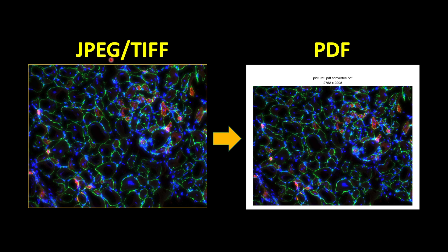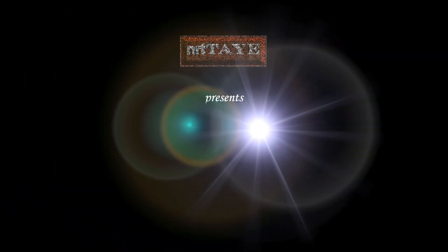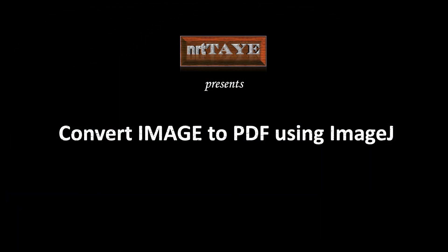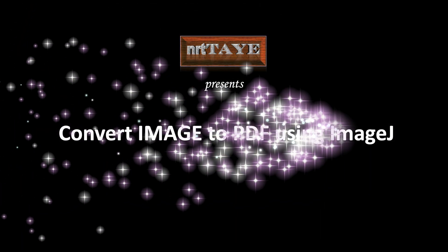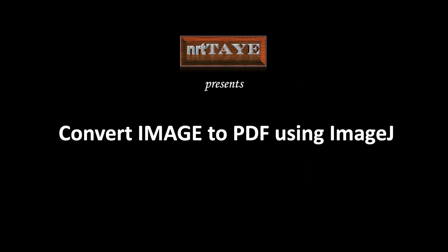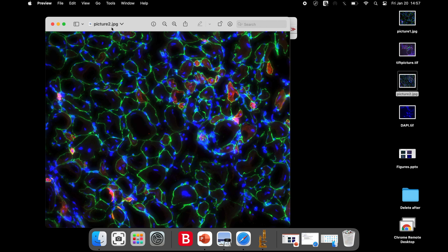In this tutorial, let us learn how to convert image into PDF using ImageJ software. For this tutorial, we will be using both a JPEG and a TIFF format image for demonstration.